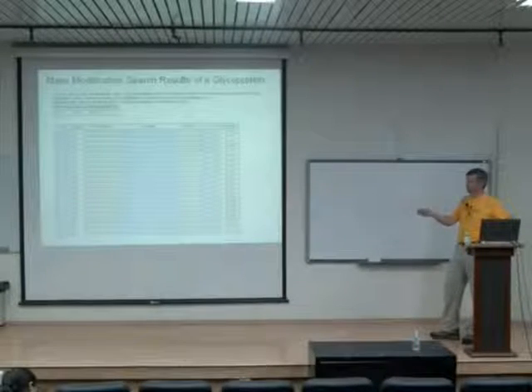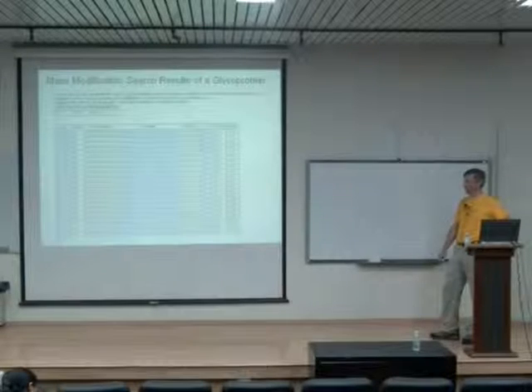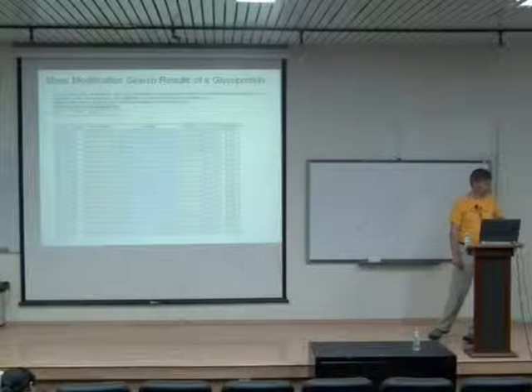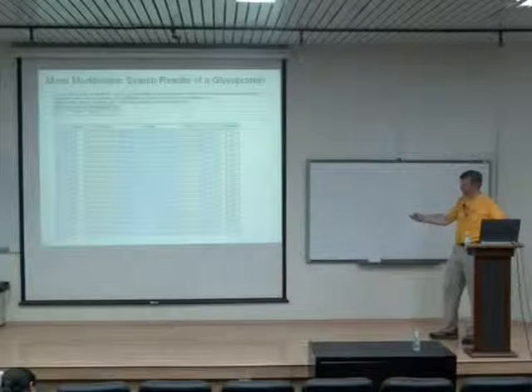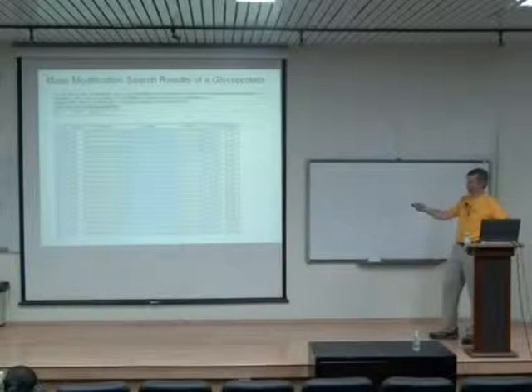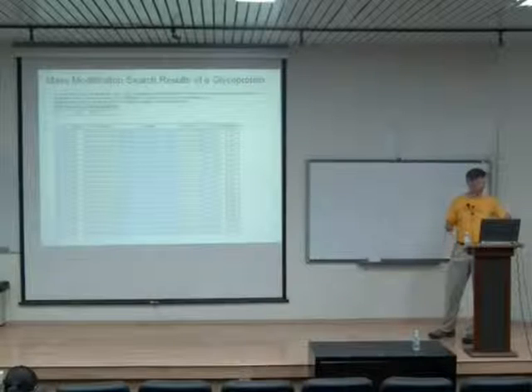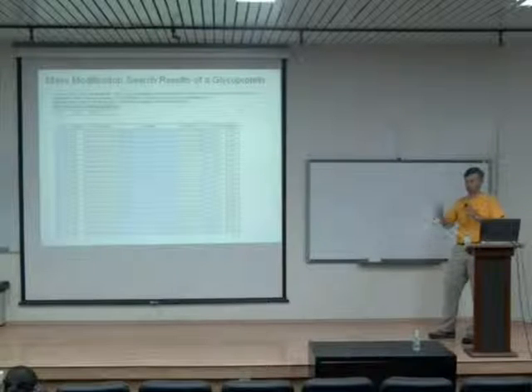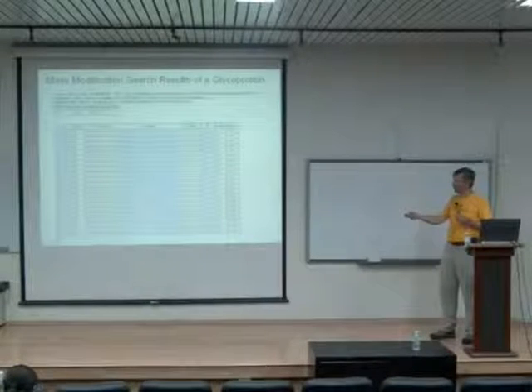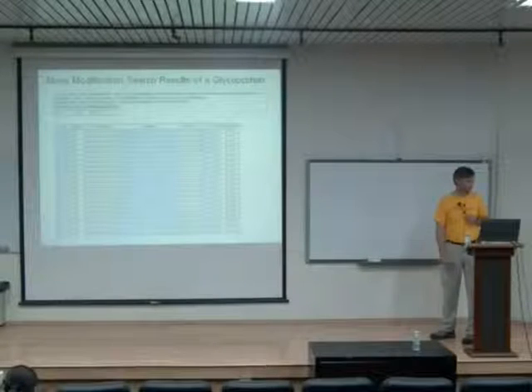we've acquired a large number of fragmentation spectra. So for this study, we may have acquired 100,000 fragmentation spectra, and these are just 20 of them. And so some of these are the same peptide that have been fragmented more than once. So we did a fractionation beforehand. We did some high pH chromatography beforehand to simplify the mixture. And in some cases, the same peptide is identified in multiple fractions, and that's why it appears multiple times here. But these are all real examples.